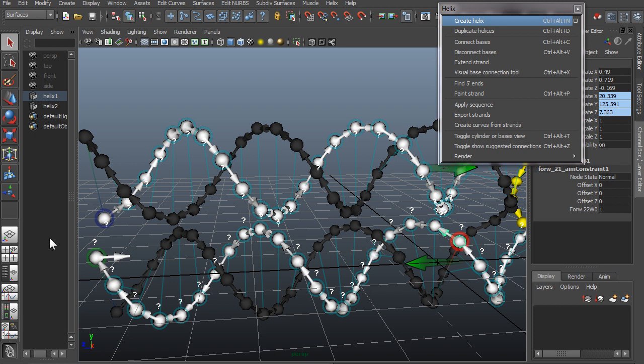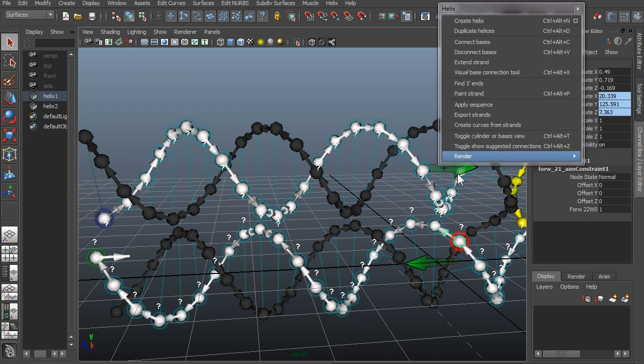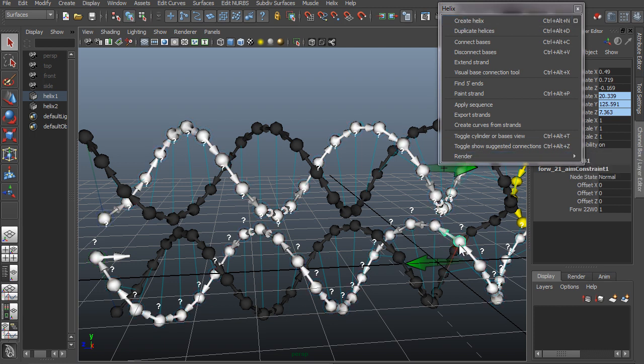If I click here, where are the end points? Oh, they're here. This rendering can be turned off if you go to the helix menu, render, and uncheck halo, then you won't see these halos if you think they're annoying.